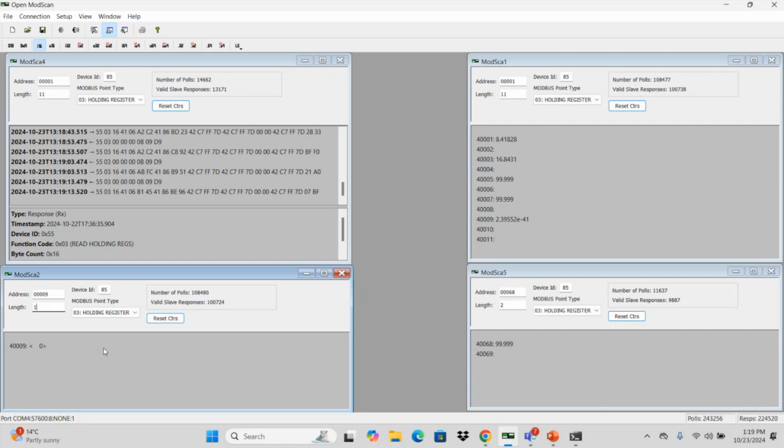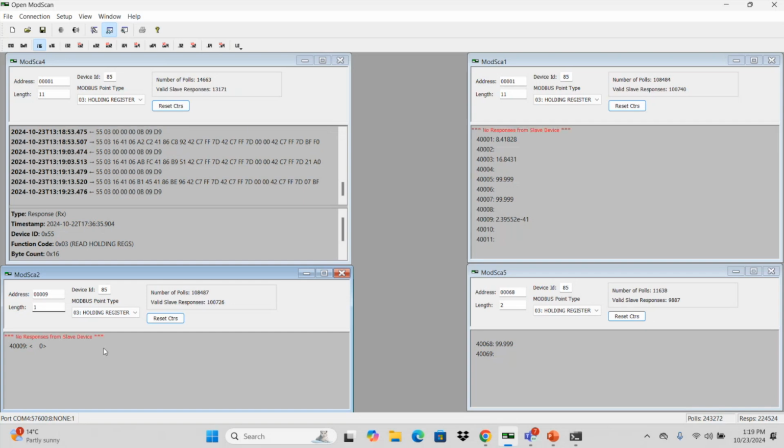This sensor is set up in autonomous mode, so we don't have to send a scan command to the sensor. So I'm just turning it on and off via a DTU. What we see is as we send the read request from the sensor, once the sensor's booted up and going, we'll get those exceptions returned, either the 08, 05 or 06 exceptions. There's your 05. The sensor's now started scanning, so now we get the 06 exception. These will be held there, and you'll keep getting the 06 until the sensor is ready to give you the first pH number, in which case everything will update as you'd expect.